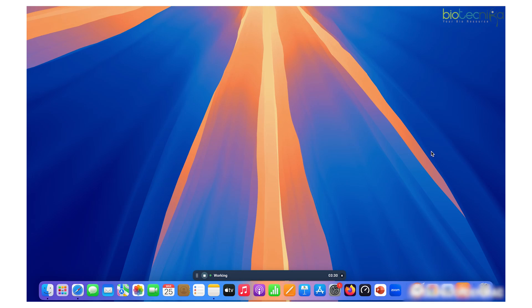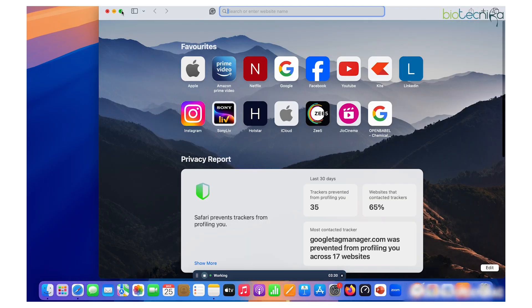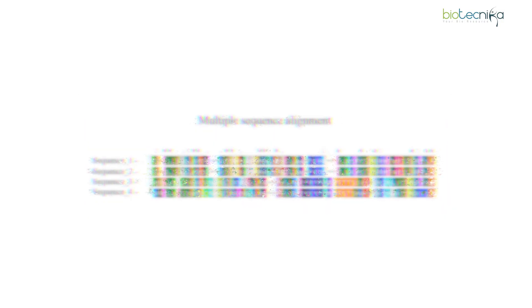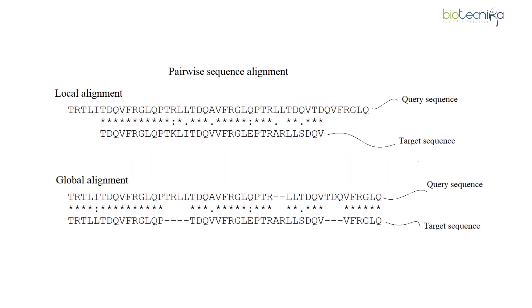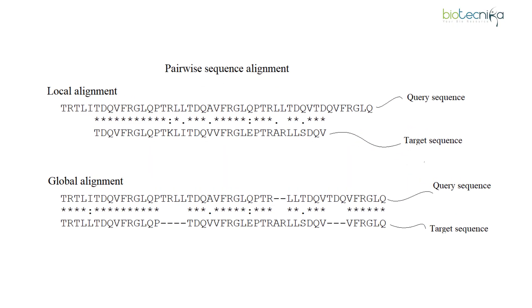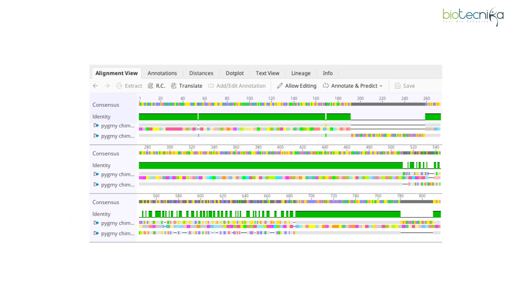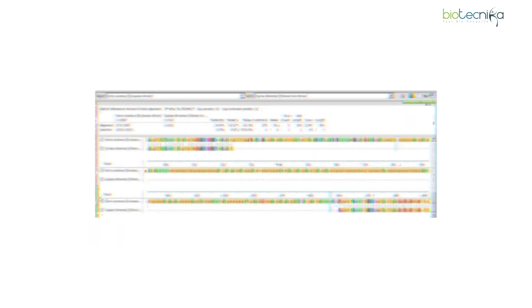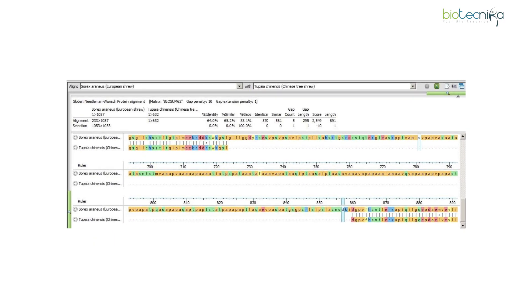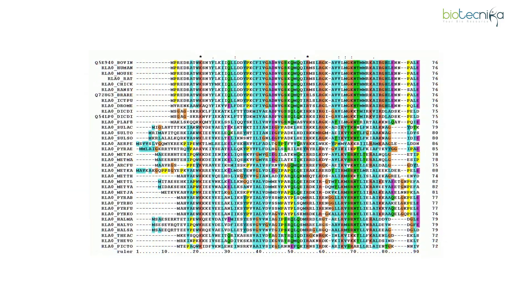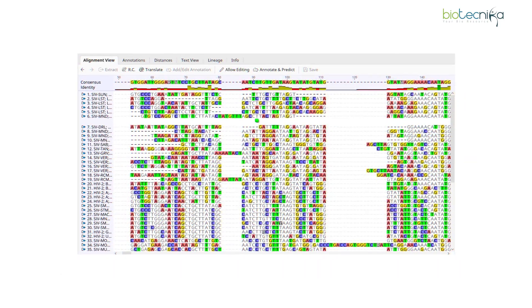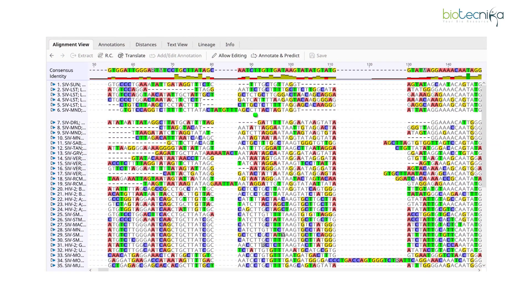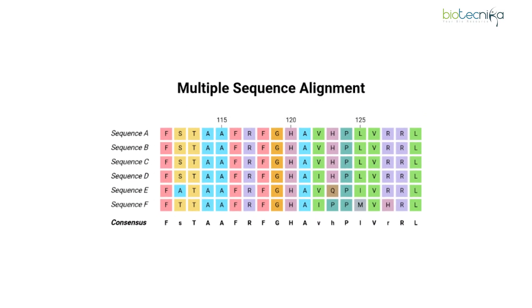Hello and welcome everyone to another demonstration video. Today we'll be looking at a tool that is very widely recognized in bioinformatics, used for multiple sequence alignment. You have pairwise sequence alignment where you align two sequences to look for evolutionary relationships, and how closely or distinctly related those sequences or species are. For more than two or three sequences, that is called multiple sequence alignment, and the number can go to N.